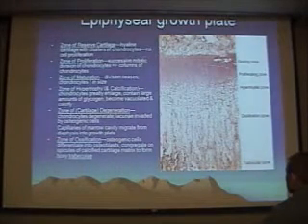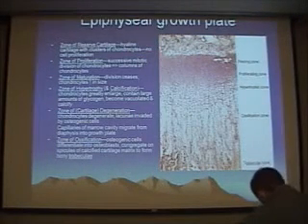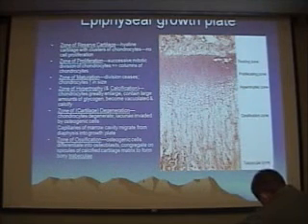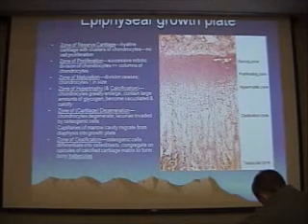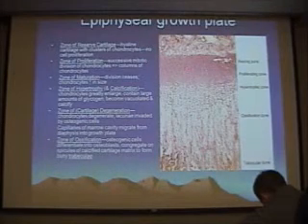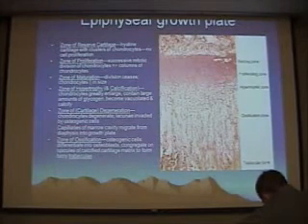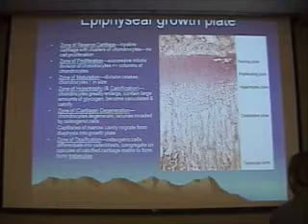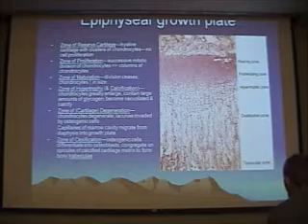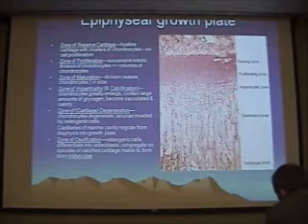At the articular end, we have a resting zone or a zone of reserve cartilage. It's basically just chondrocytes hanging out, and then next to it we have a proliferating zone. This is where we have chondrocytes undergoing successive mitotic divisions, so the cells start to line up and form these rows. After they divide, they then mature, so we have a zone of maturation, and then the cells, after they mature, begin to produce product. They begin to produce lots of glycogen. And so as they produce more and more glycogen, the cells enlarge, they become very highly vacuolated, and they hypertrophy in the zone of hypertrophy.